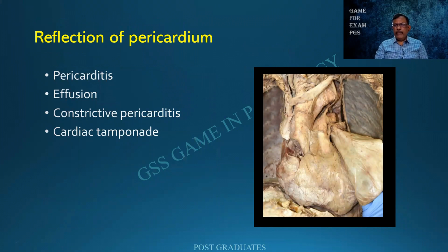And coming to the different parts of the heart, before we open up, the first thing that we will have to do is to reflect the pericardium. The pericardium can be reflected by means of an incision and then gradually separated. In fact, it should peel off on its own, but it gets adherent in the case of a pericarditis. And in this particular case, I am finding that it is not transparent.